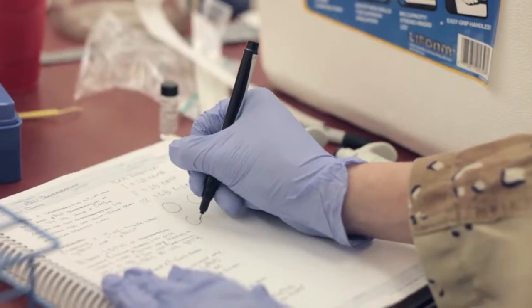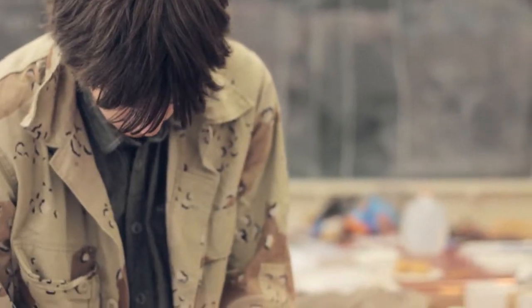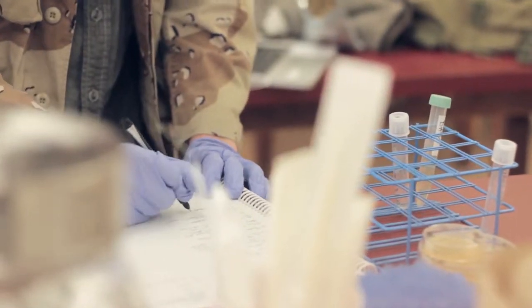Whenever we do an experiment there are multiple different perspectives — one from him, one from me. We started off with lots of statistics and probability and then we kind of got into more of wet labs, which is what you see going on here.